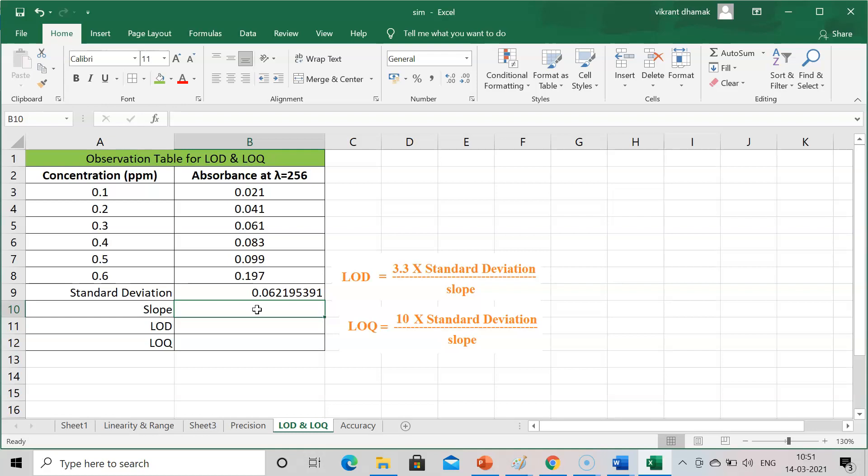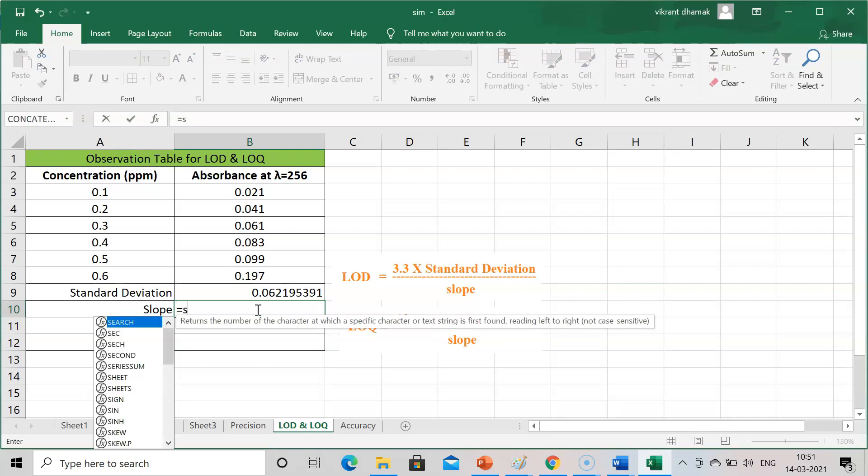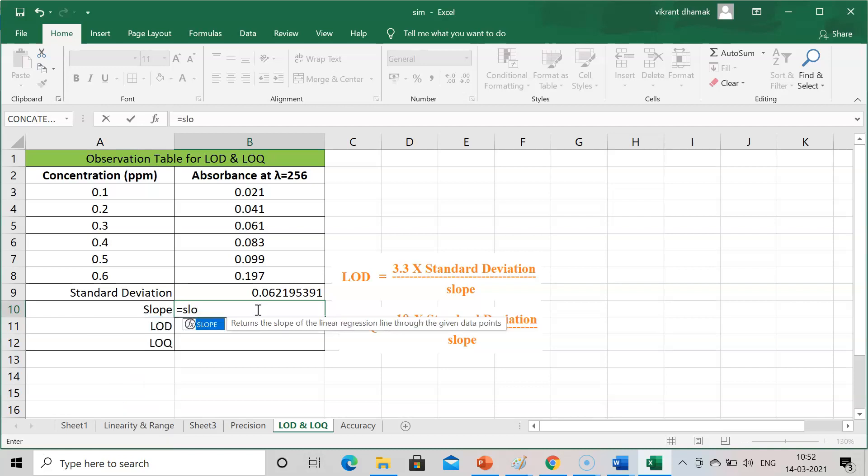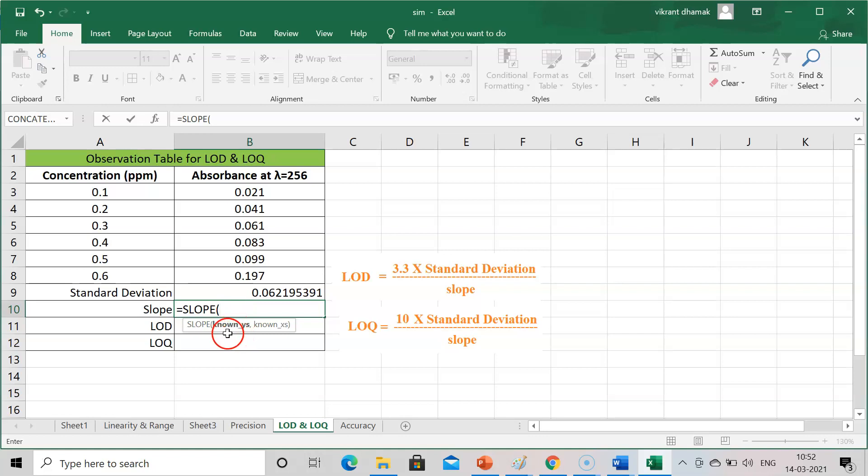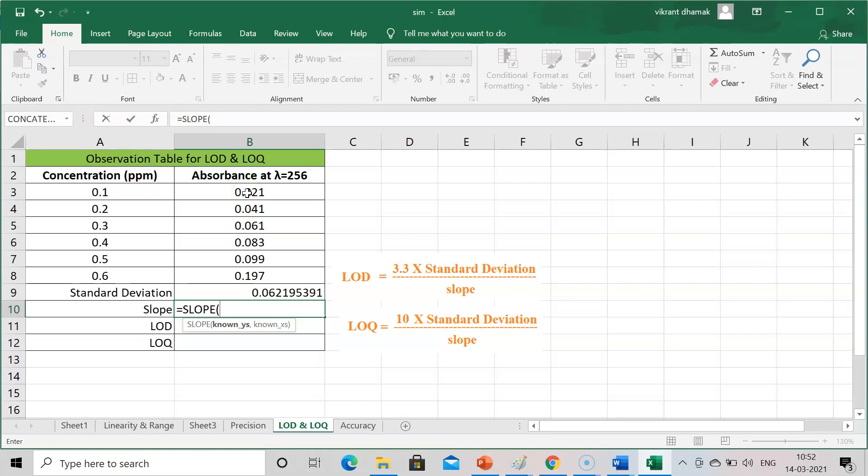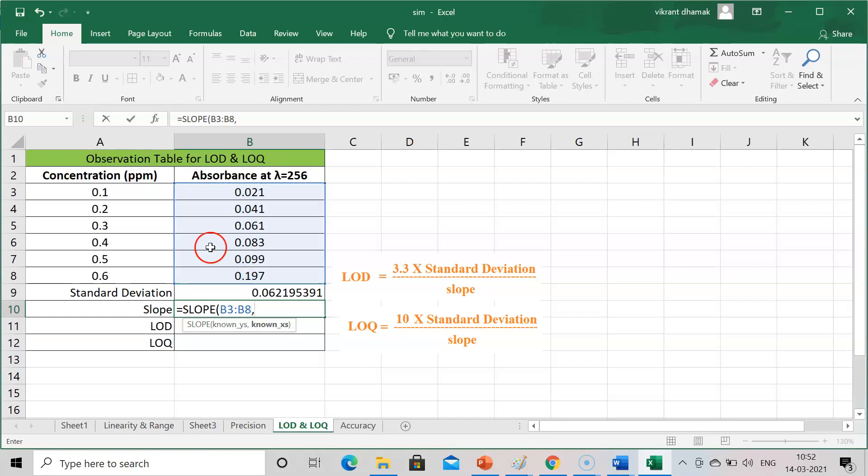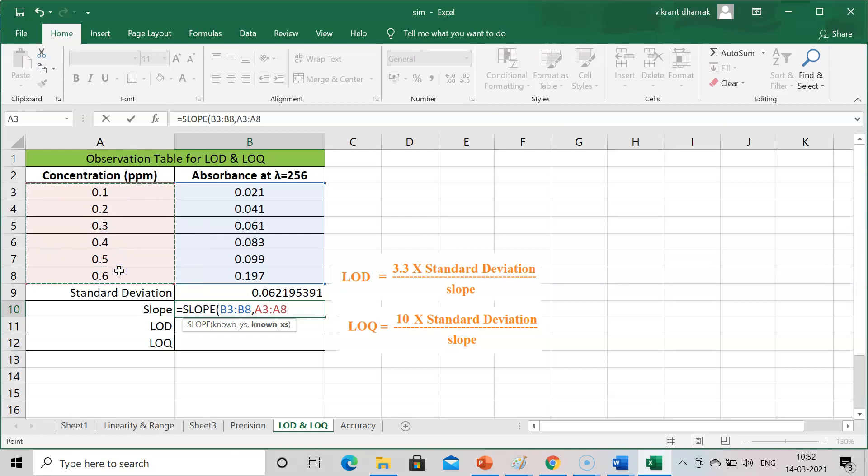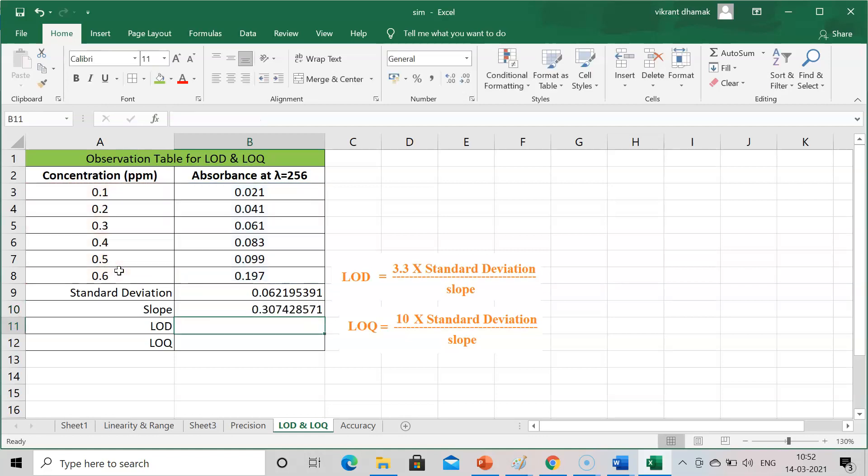After that, for calculation of slope, press equal to SLOPE. Important to know is that you will get known Ys and known Xs. Y coordinate has absorbance and X coordinate has concentration. So select Ys firstly. After that put a comma, and then X, that is concentration part, and press enter. You will get the slope.